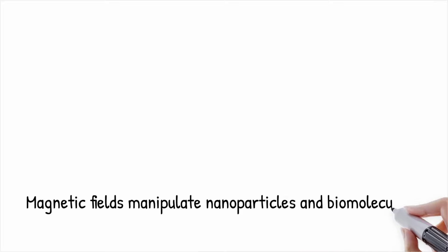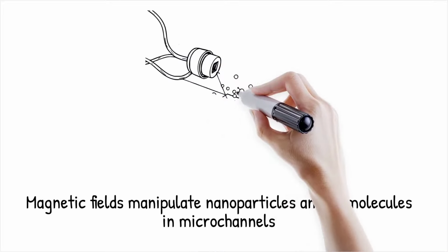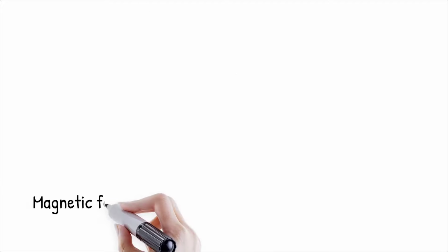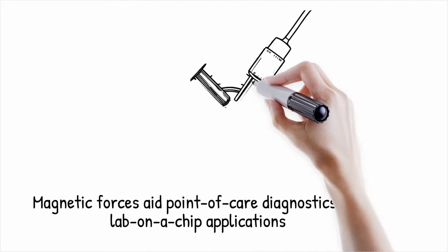Magnetic microfluidics leverages external magnetic fields to manipulate magnetic nanoparticles, ferrofluids, or magnetically tagged biomolecules within microchannels. This enables controlled transport, mixing, and separation without physical contact, reducing contamination risks.